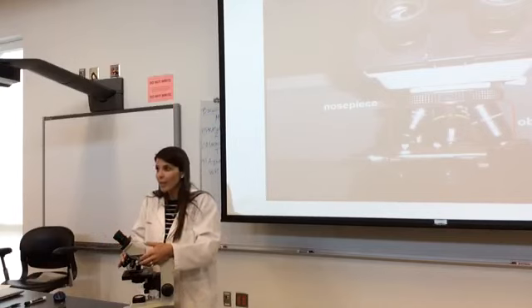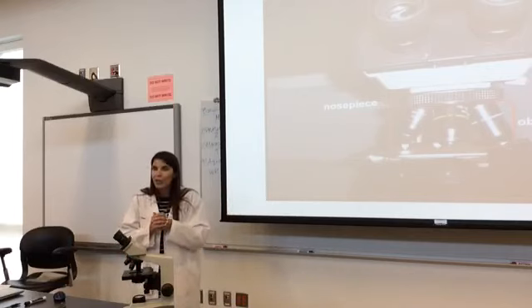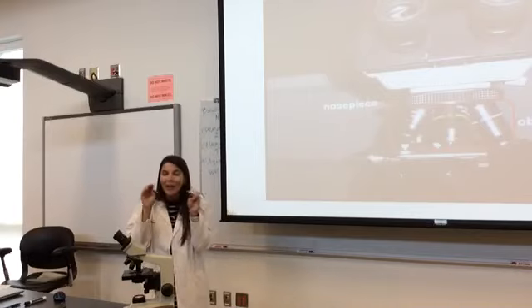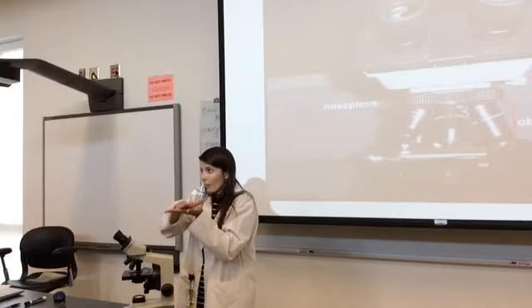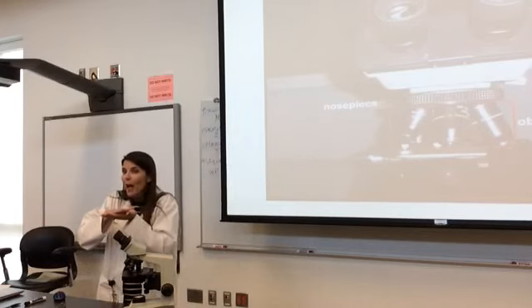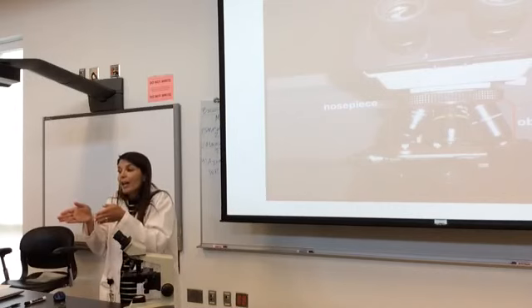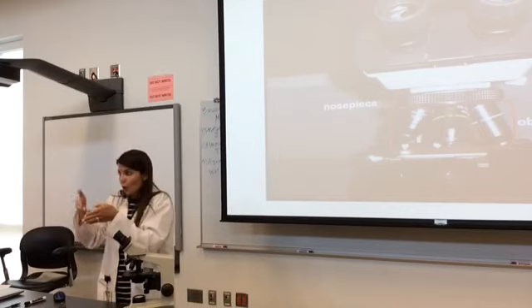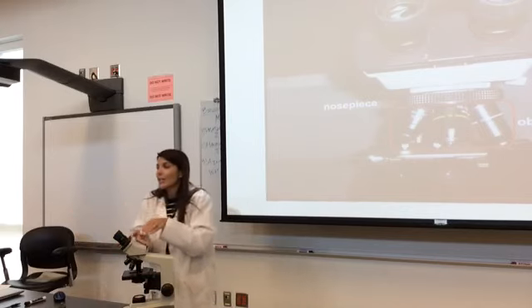Go from medium, please and thank you, to high power, which is the 40, the blue objective. What does your working distance look like? It's very small, and if your microscope slide is there, no exaggeration, it's usually right on top of it. Okay? What happened to what I can see? Did it get bigger or smaller? It magnified it larger, but the field of view got smaller. So my working distance decreased.